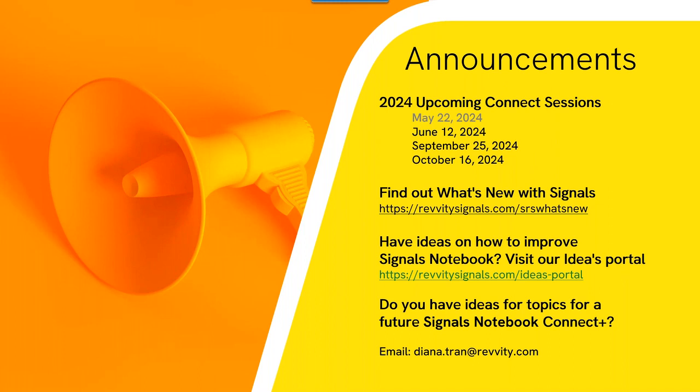But I understand science is vast. Sequencing and omics data can be very big, so we'd obviously want to make sure it's appropriate. First, would we ever have that data in our system? The answer needs to be yes. And second, we'd want to do a technical check once the answer is yes, we should have this data in our system. But really great question.